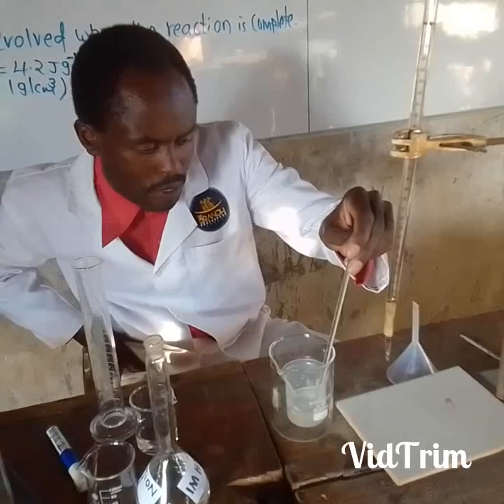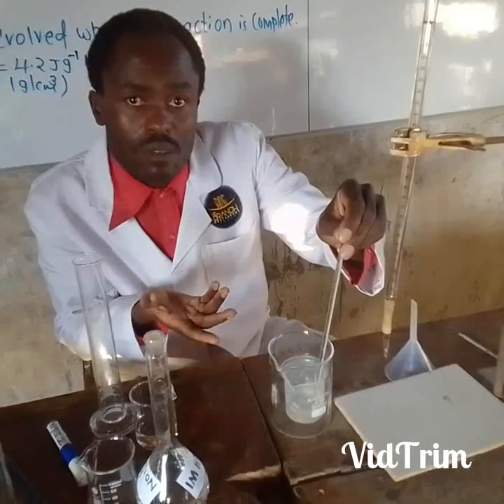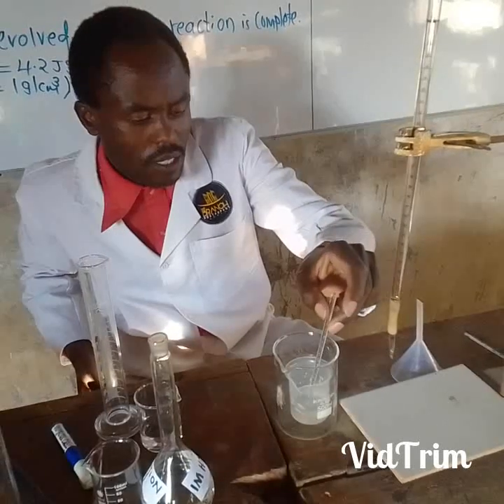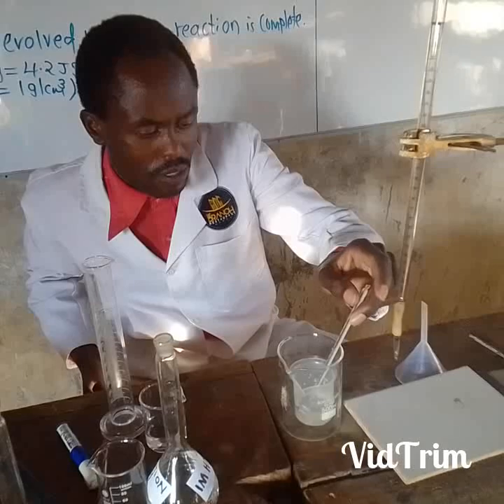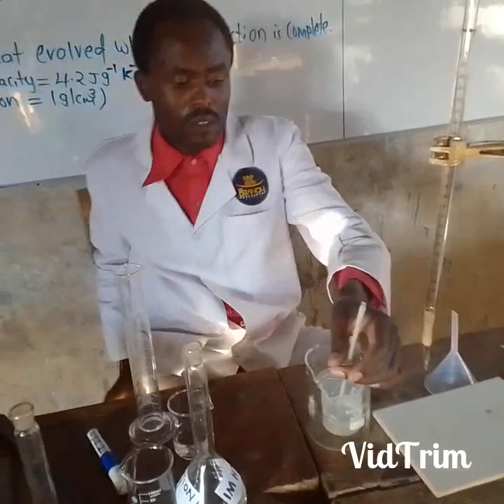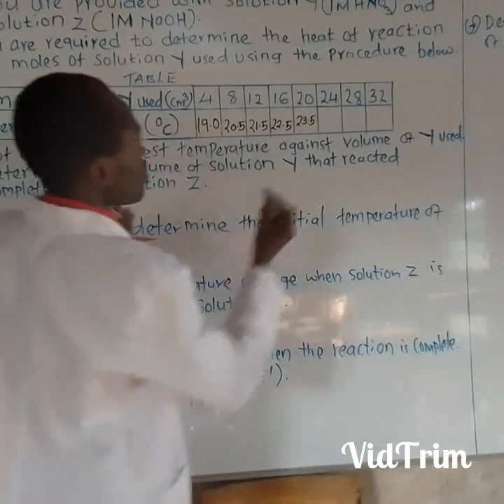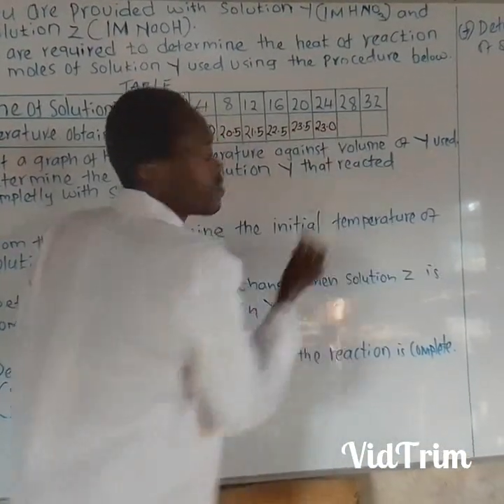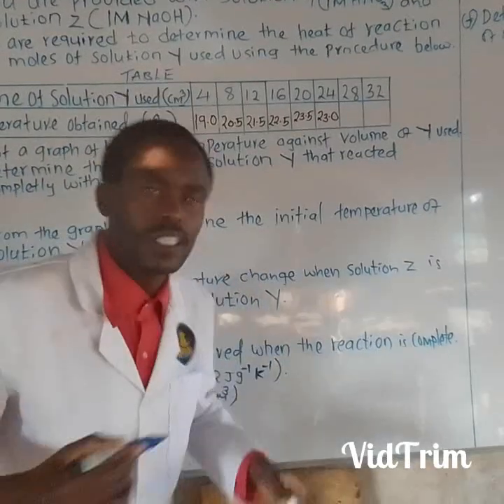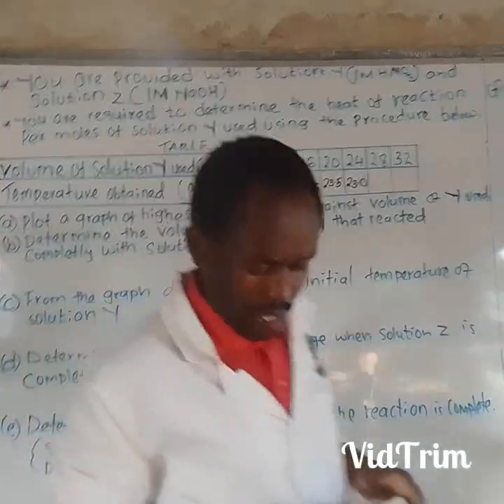It has dropped to 23.0, my student. It has dropped to 23.0. Are you getting? Now the temperature has started reducing.